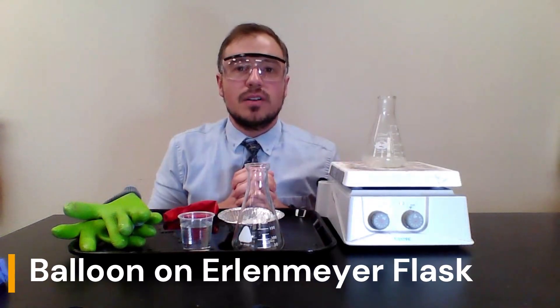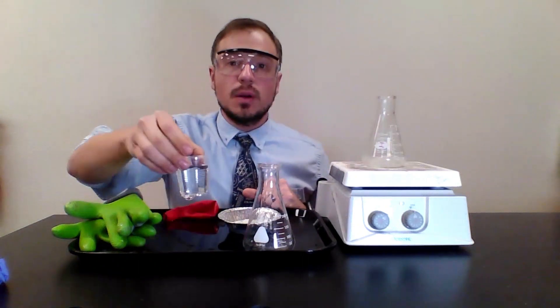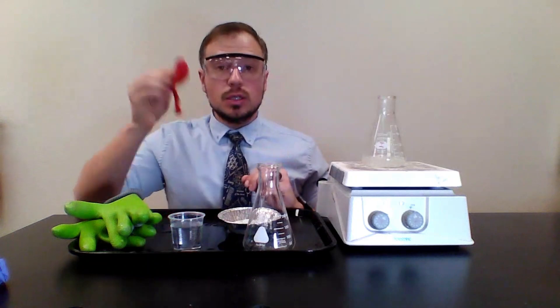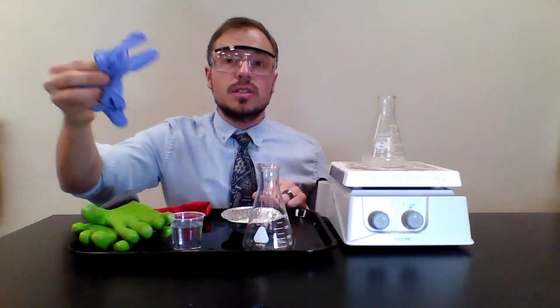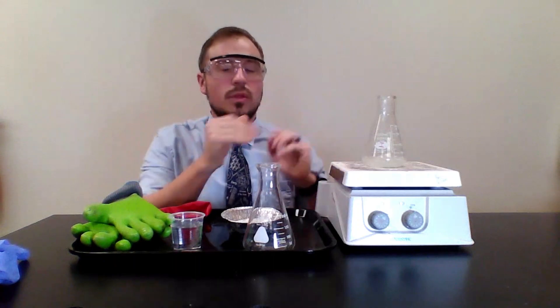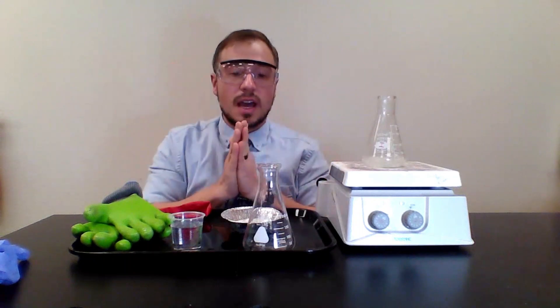This is the balloon on Erlenmeyer flask lab. For this lab, what we're going to need is an Erlenmeyer flask, a little bit of water, a balloon, an ice bath, a couple of gloves, and of course safety first — put on your safety glasses.